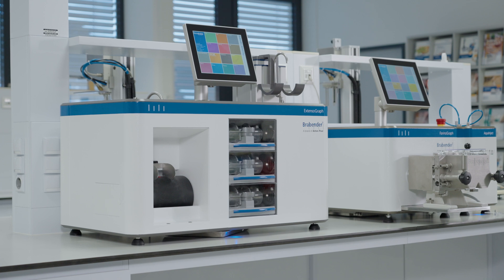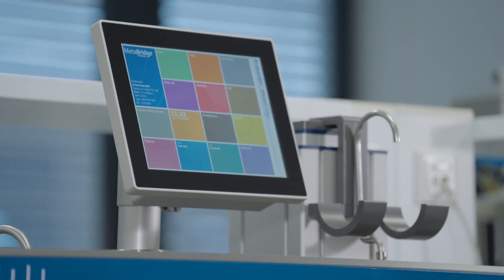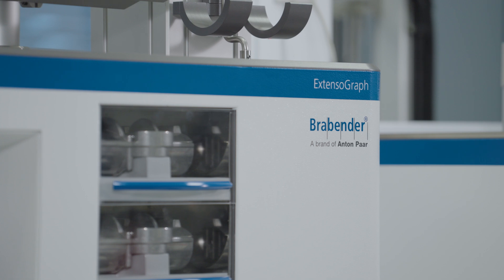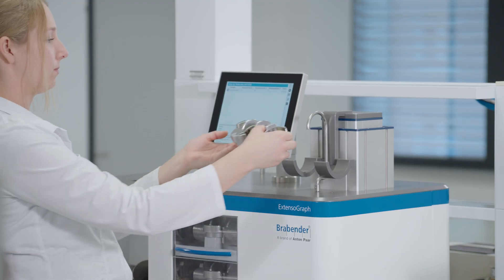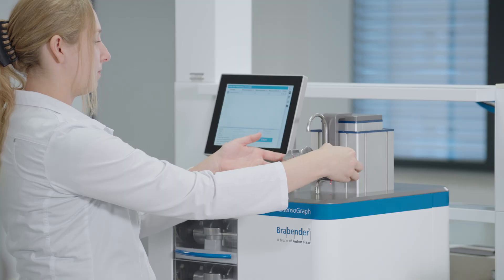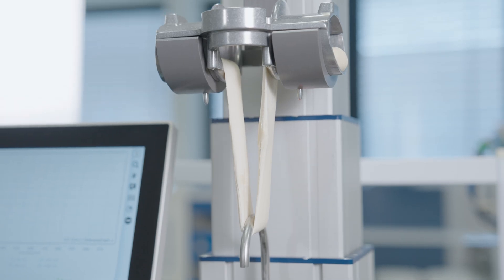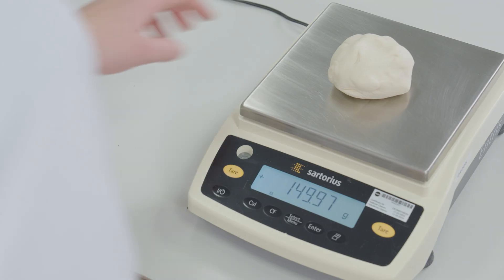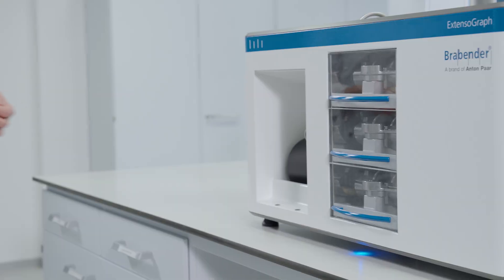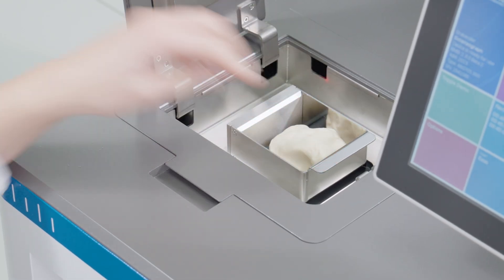In the Brabender world of baking, technology meets passion. Introducing the new Extensograph flour and dough analyzer. Natural fermentation processes take time — this is why we at Anton Paar commit ourselves to testing dough extensibility and stretching under real-life conditions. No shortcuts, no compromises.